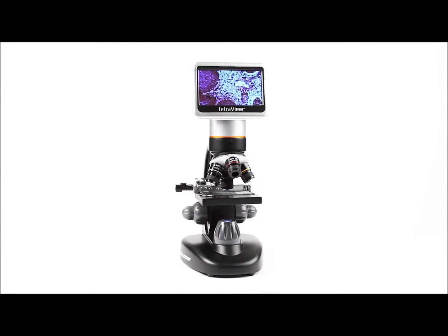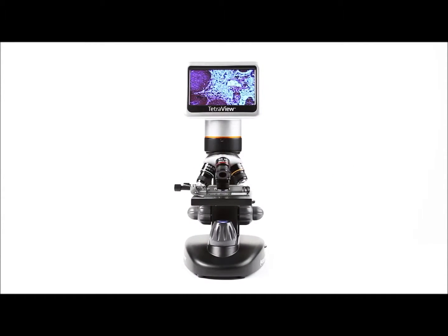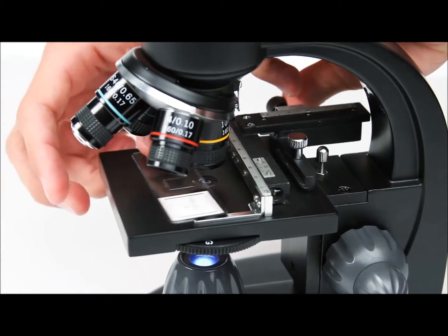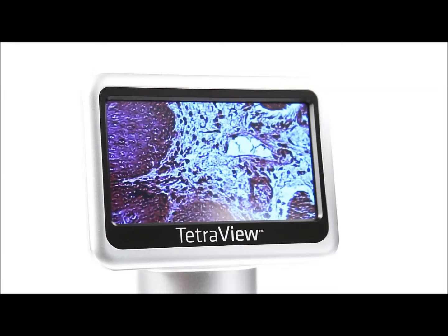Examine specimens in sharp detail with Celestron's new TetraView LCD Digital Microscope. View subjects on Celestron's largest microscope display.